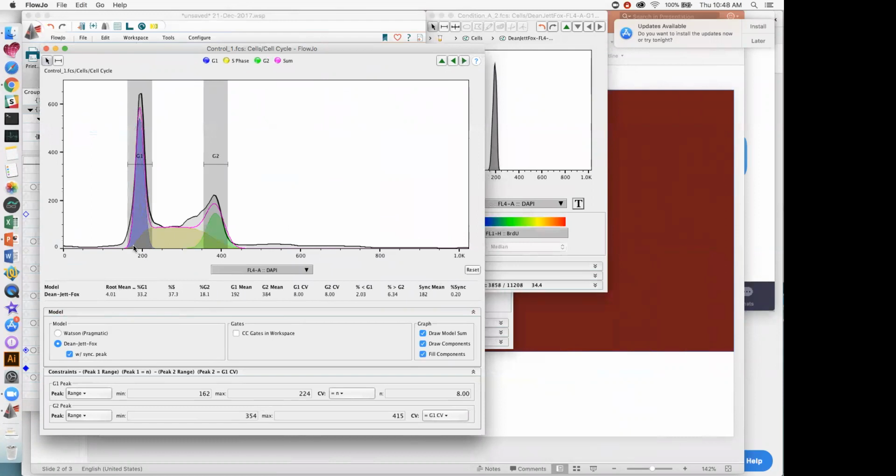and the RMS value here. So when I was constraining the G1 phase on this model, I constrained the region, and then I was looking to see how well my blue histogram here kind of meets up with the histogram that is outlined in black. Personally, I like it to fit a little bit wider so that it occupies the vast majority of space here.